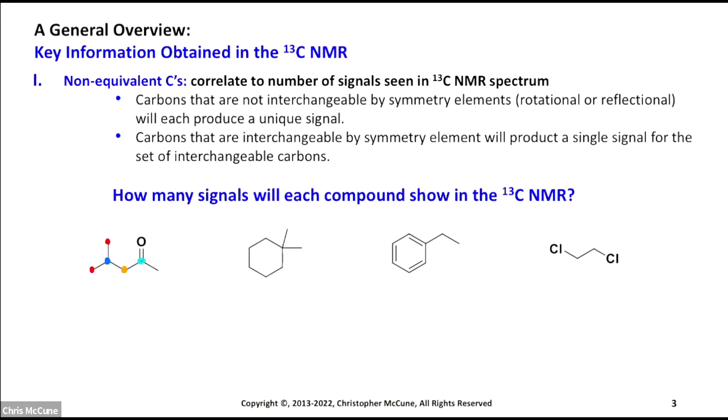Here I have a carbonyl carbon, so that's going to be different and unique. And then lastly, on the far end, I've got a CH3 group, and that CH3 is different than these two CH3s because of its connectivity. It's next to a carbonyl, whereas these two are adjacent to a CH. So it just has a different environment altogether.